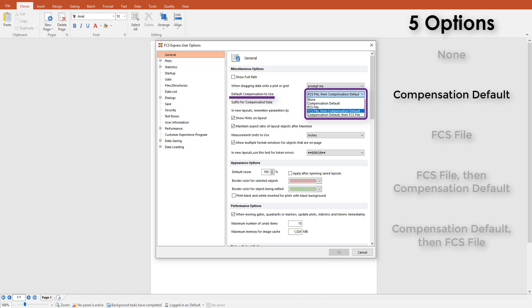The second option is compensation default. A single compensation may be set as the default per layout. This may be a compensation written at the time of acquisition, manual compensation, or automatic compensation.